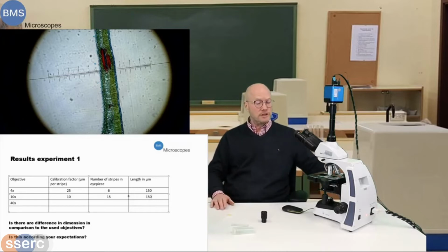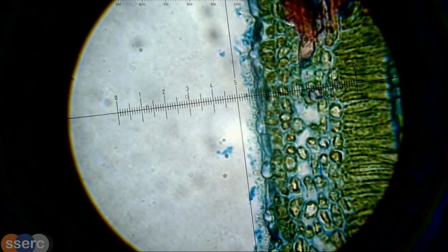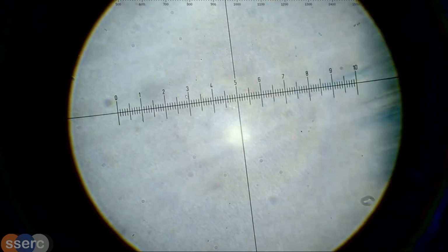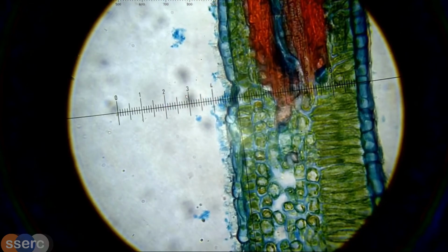Let's go to the 40 times. More or less at the same height.